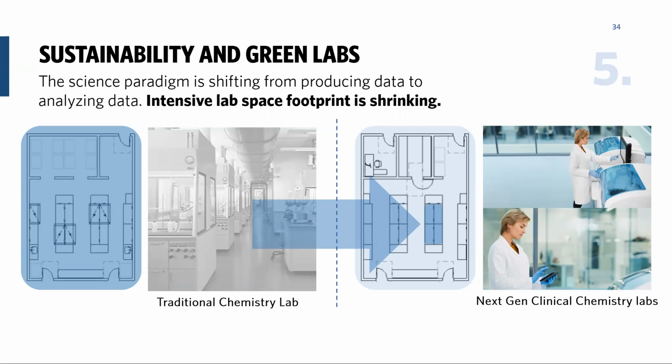But the real game changer in this discourse is to recognize that the wet lab footprint in the traditional sense is shrinking. The equipment you see in this image on the right does all the clinical lab testing in these fully automated machines in only 20 square feet and in a fraction of the time.